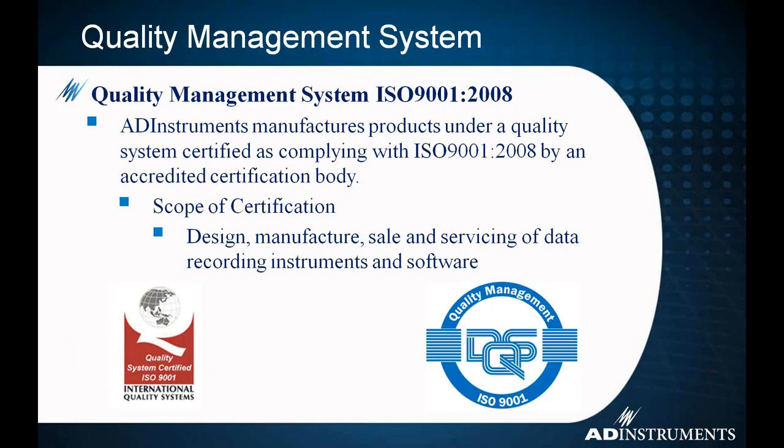Another question I get quite frequently is, I have my PowerLab, how do I know that what I'm getting out of it is actually true? What standard is this held to? ADInstruments pays to get certified with the quality management system ISO 9001, and they look at our manufacturing and our validation protocols to make sure that we conform to the standards that I've listed previously here.